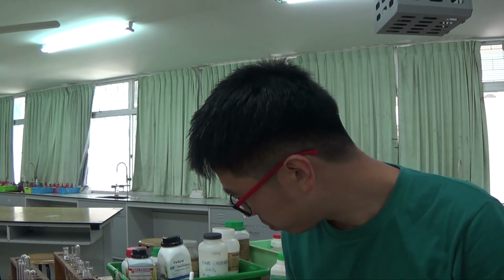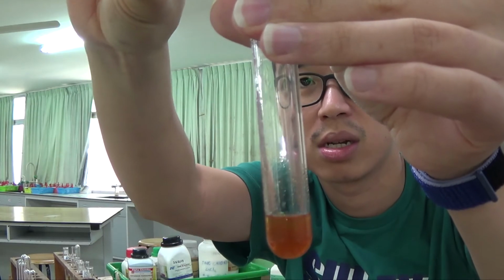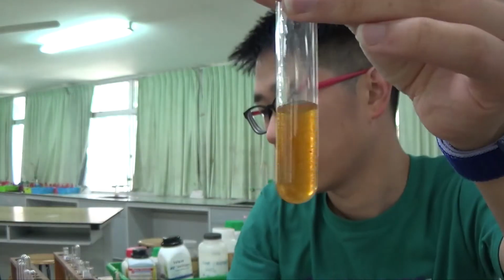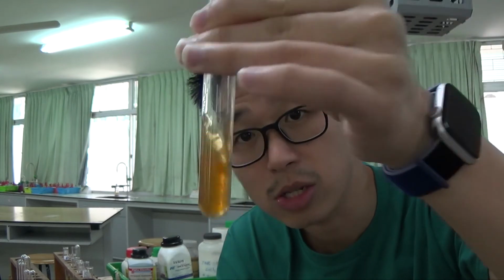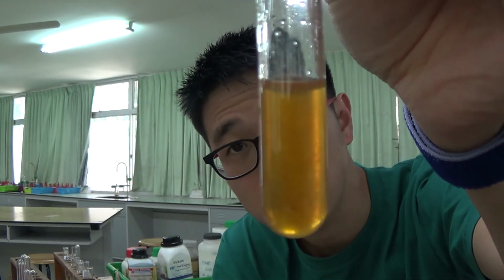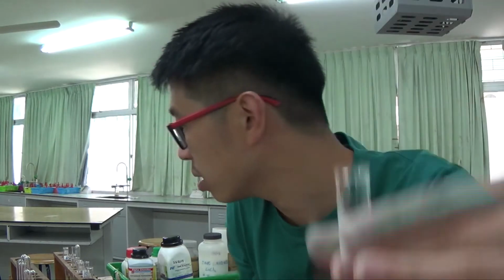It is formed, always observe. And then what happened when I add excess sodium hydroxide to this? If I use up my sodium hydroxide, I need to go and get some more. It's the same issue again. You get that suspension, the solid doesn't go away, the precipitate doesn't go away. When I started here, I added this much, and then this much is in excess. You could add more and more sodium hydroxide.